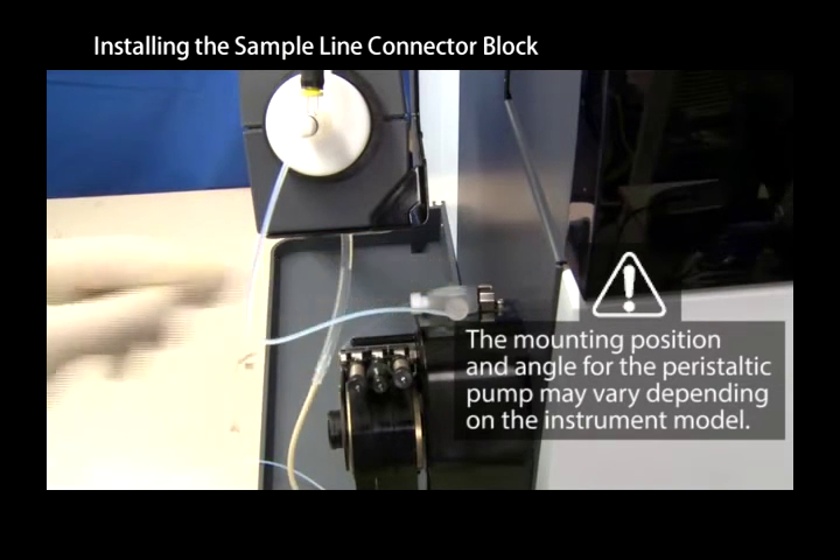The electrically conductive connector fits in the ground clamp, making an electrical contact between the sample and the chassis.